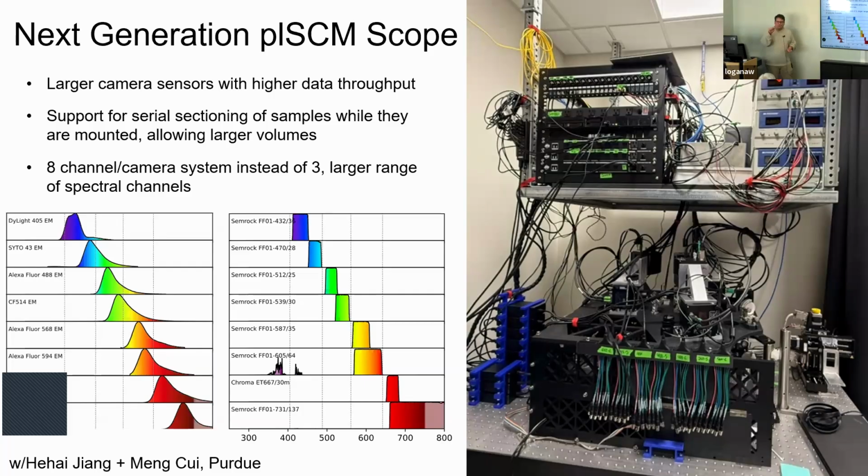If you plotted it out, when everyone got in the morning and they triggered the AC at like 7 a.m., the resolution would increase. Then you would go through the day, it would hit like 6 p.m. and they would start turning everything off, and you would see the resolution drop by like 50 nanometers or something, just because of the heat expansion and whatnot of the room as everything went on.